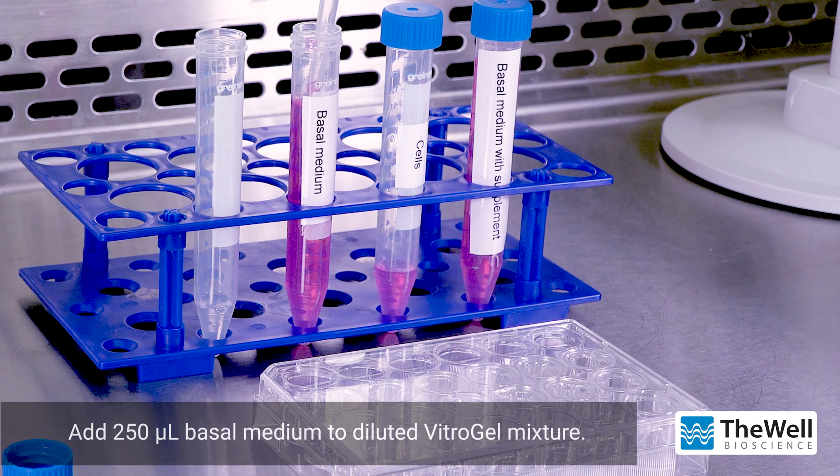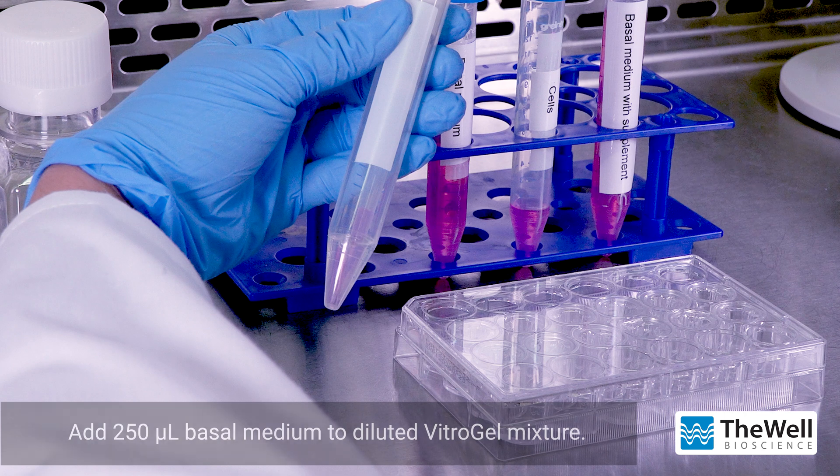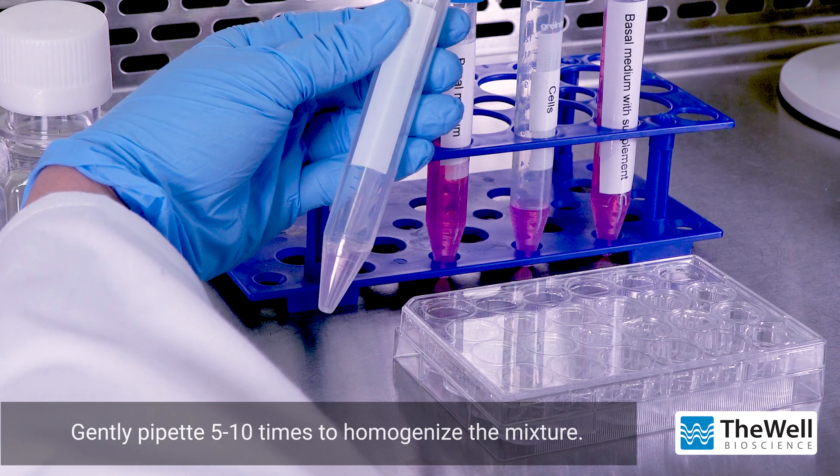Add 250 microliters of basal medium to the diluted Vitrogel mixture and gently mix 5 to 10 times to homogenize the mixture. Keep the mixing ratio between the diluted Vitrogel and cell medium at a 4 to 1 ratio.